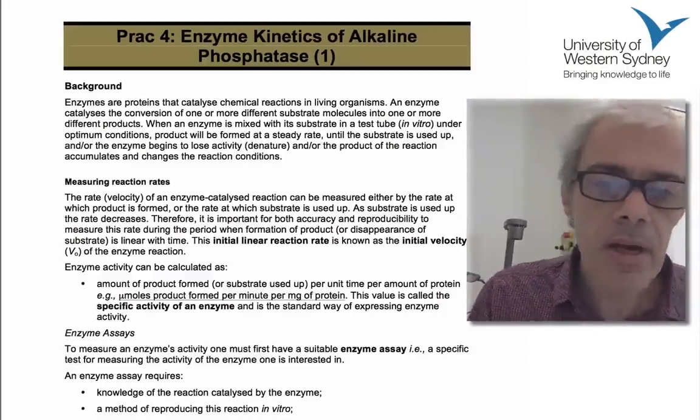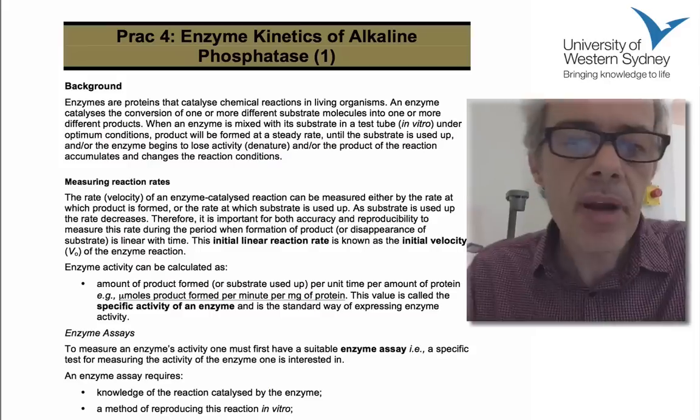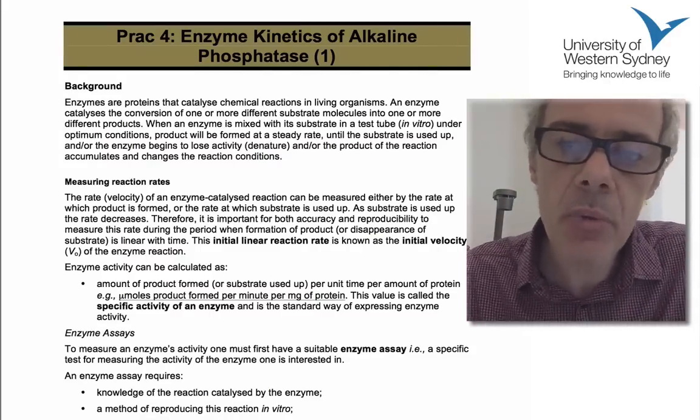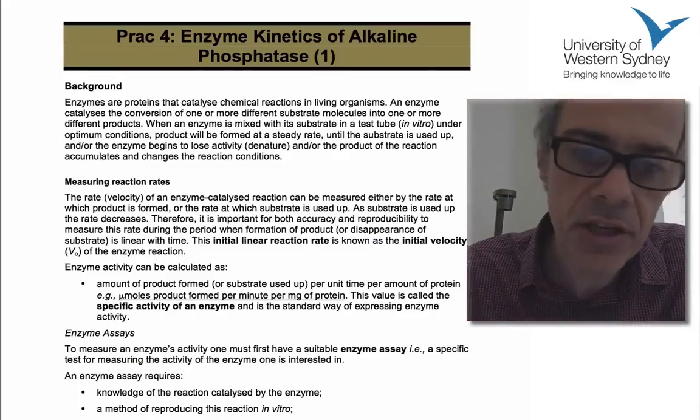Okay, hello everyone. I'm just in the lab now, that's why there's a lot of background noise. But I'm just giving a quick demonstration of how to calculate the Lineweaver-Burk plot from the experimental data you have.